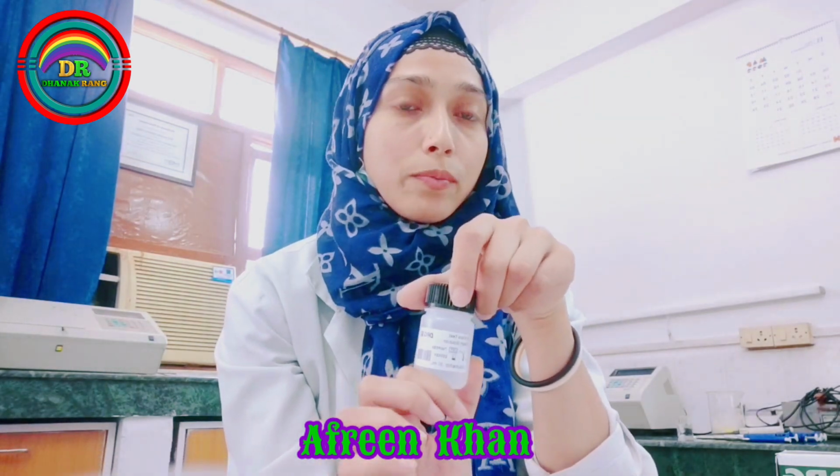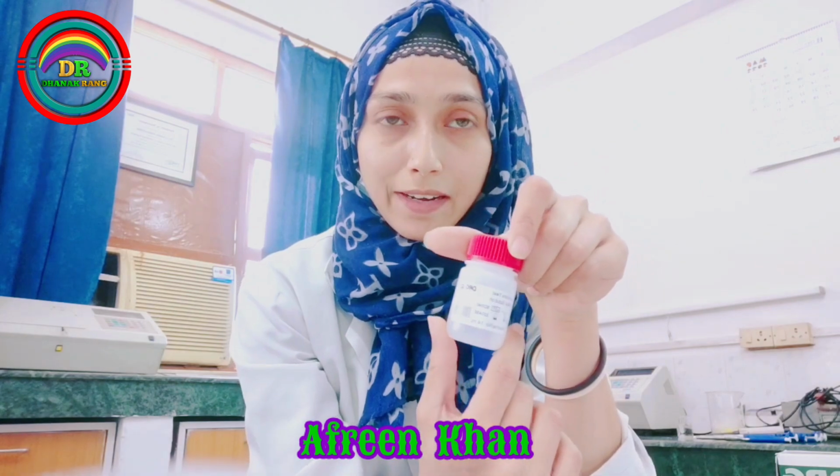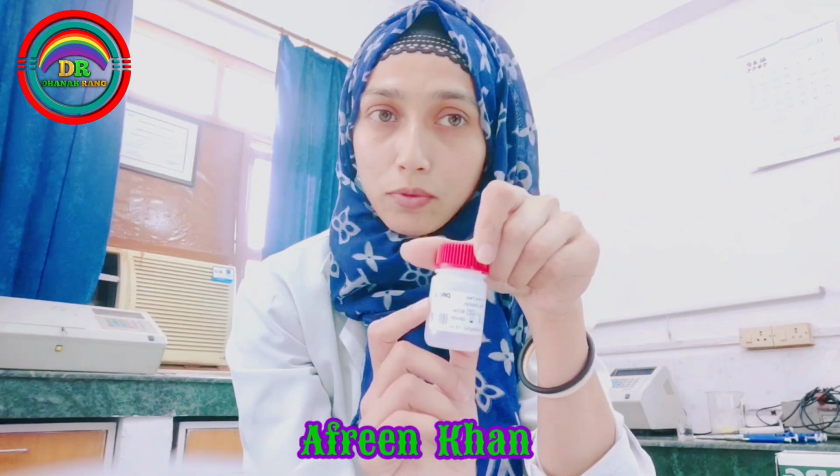It is of 40x concentration. So this is the stock solution. Whenever we perform the experiment, we have to make the working solution of 1x concentration. Then we have this substrate solution, which is the substrate for our enzyme. And then we have this stop solution. At last we have to add this stop solution to stop the reaction.